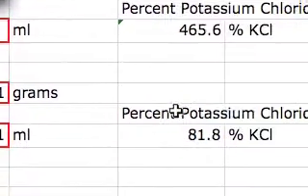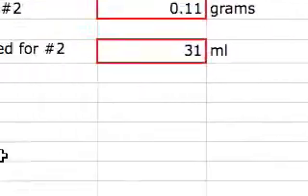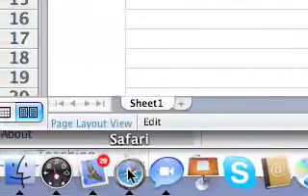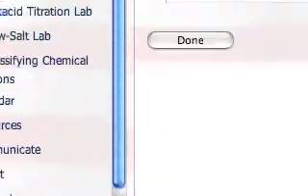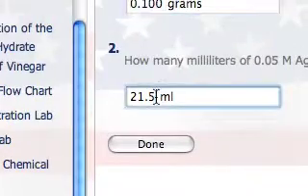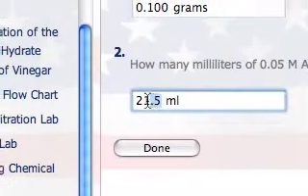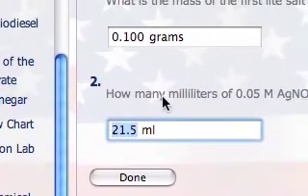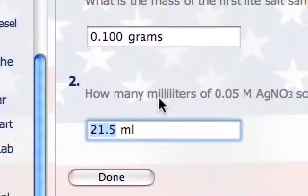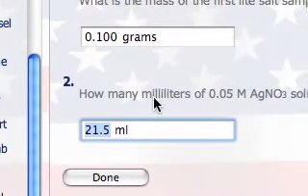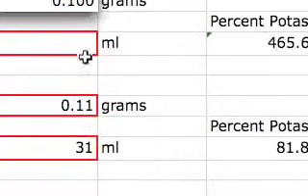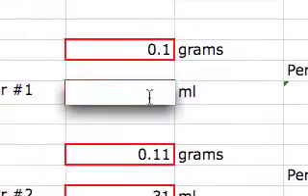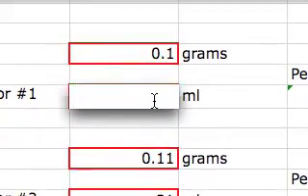Go back to the form, and now copy the milliliters of silver nitrate that you used. Copy that, go back to your form, and paste it in here.